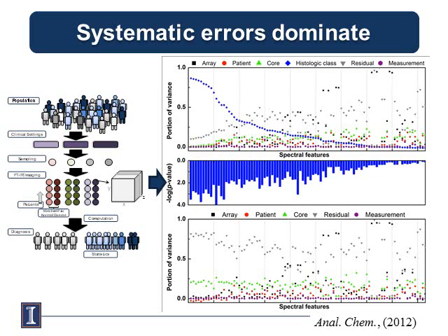So what we did here was we took a population of patients, and we took multiple samples from the same patients. All of these patients were from different clinical settings. There were a number of samples from them, and then we performed FTIR imaging on them. So now we have a data set for each sample from each patient from each clinical setting. And this pretty much involved all the variability that we could ever think about in IR imaging data.